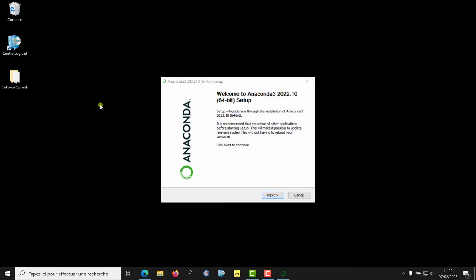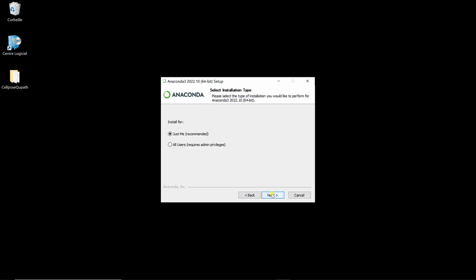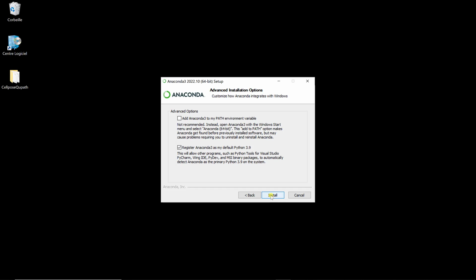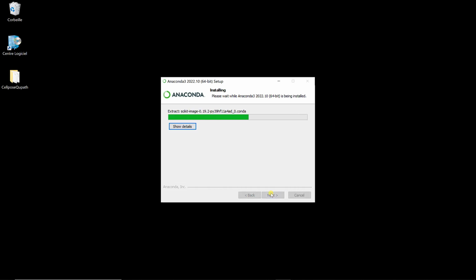And it asks me if I want to install Anaconda, so I'm just going to go next, agree. Next, I'm going to install it in my user folder. And I'm going to install it just with the regular options. So again, I'm going to speed up the video so you don't have to wait for the entire installing time.